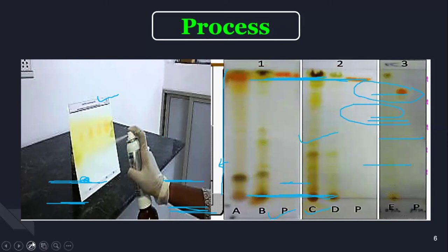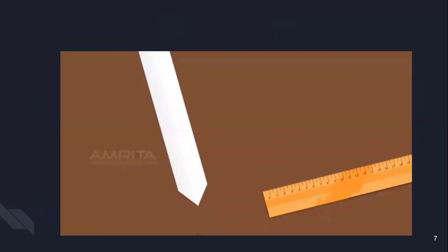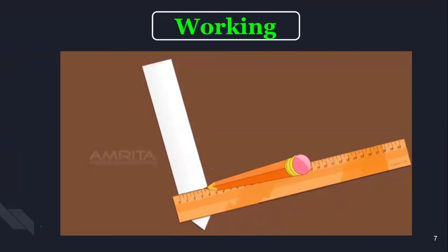So you can see now how these spots are going to run with the capillary action from bottom to top. So this is how you can now visualize the spot with the help of the spraying reagent. ठीक है, so I hope now the entire methodology you can understand very well. Now this is actually one of the animated videos. From this video you clearly understand all the methodology and process. So जैसे मैंने आपको बताया था very initially आपको ये mark the reference line.